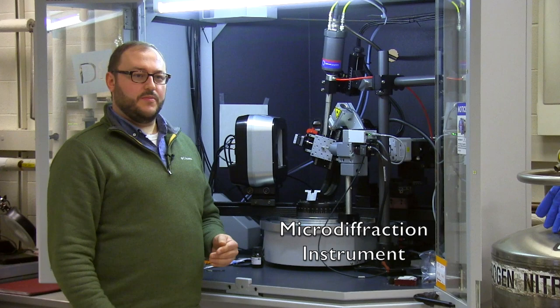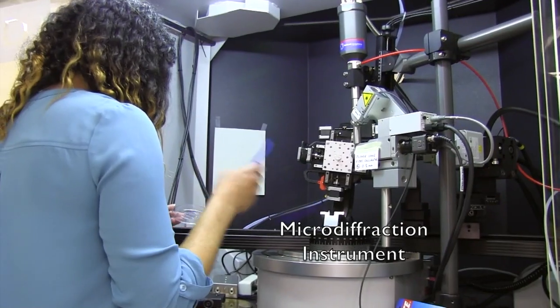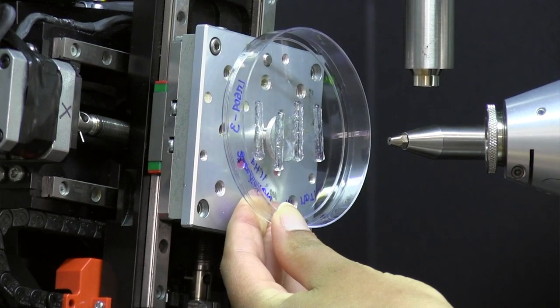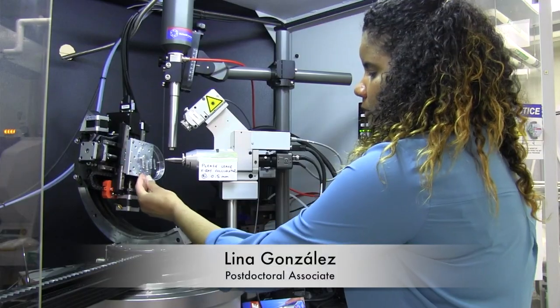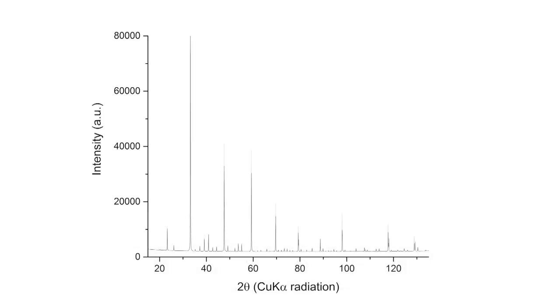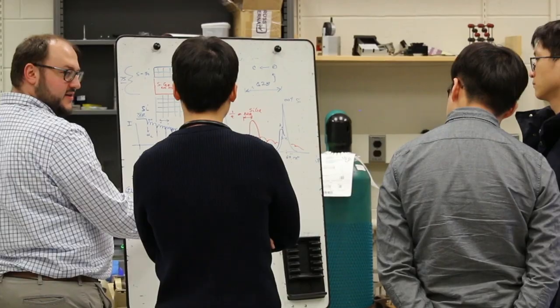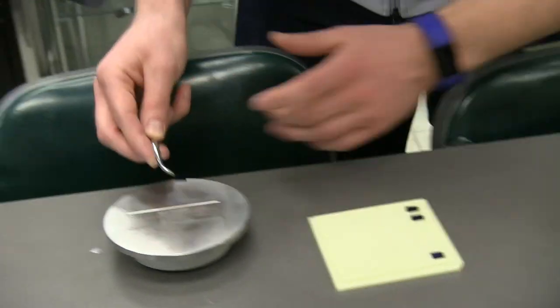Polycrystals are ubiquitous within our world. It turns out we're standing on polycrystalline material. Most minerals are made of polycrystalline material. This lab analyzes polycrystalline materials in order to find out the atomic composition. I also teach practical research skills for X-ray crystallography, so that you can learn about the structure of materials at the atomic scale.